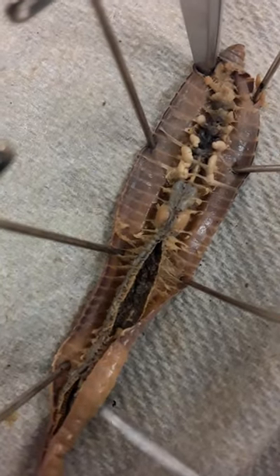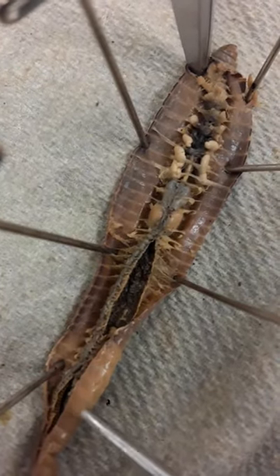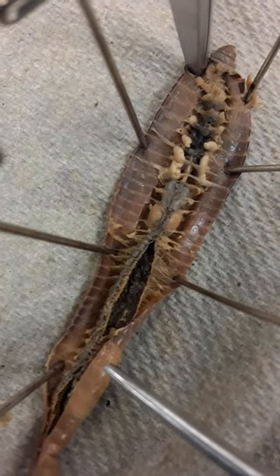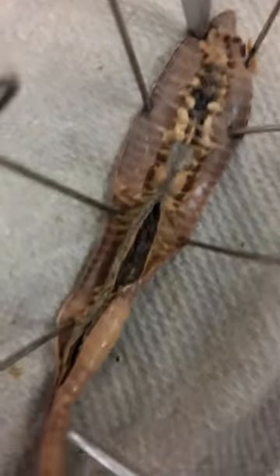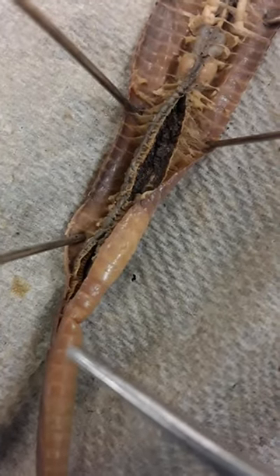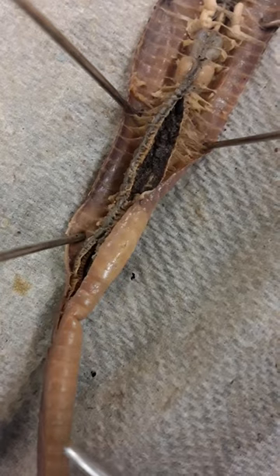The clitellum right here is that kind of little node area, lighter colored, towards the head of the earthworm. The setae are going to be along the sides here — you can't see them, but they would be what the earthworm uses to propel itself into the earth. And then at the far end over here, you would have the anus at the end.